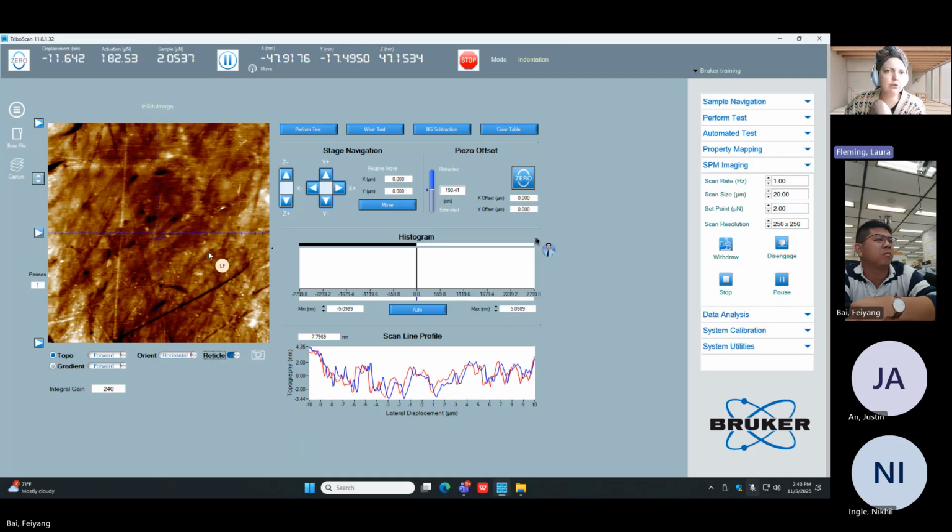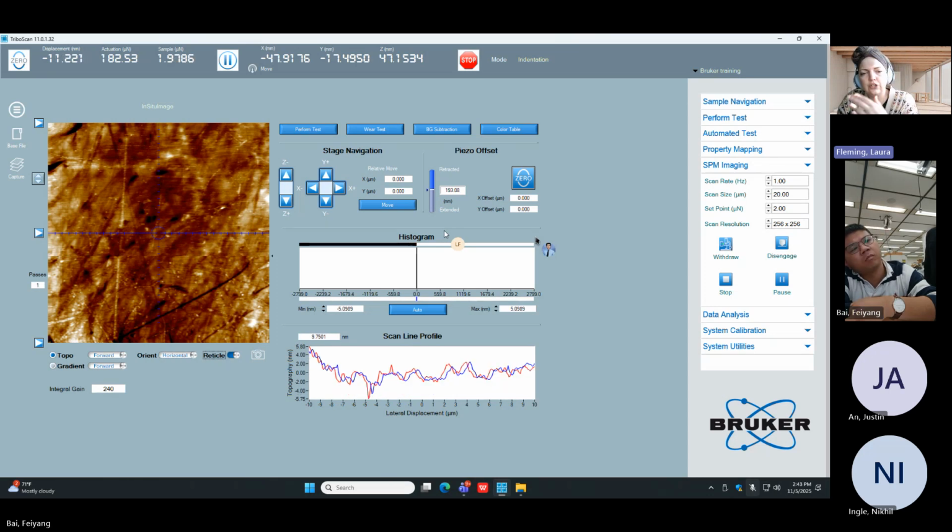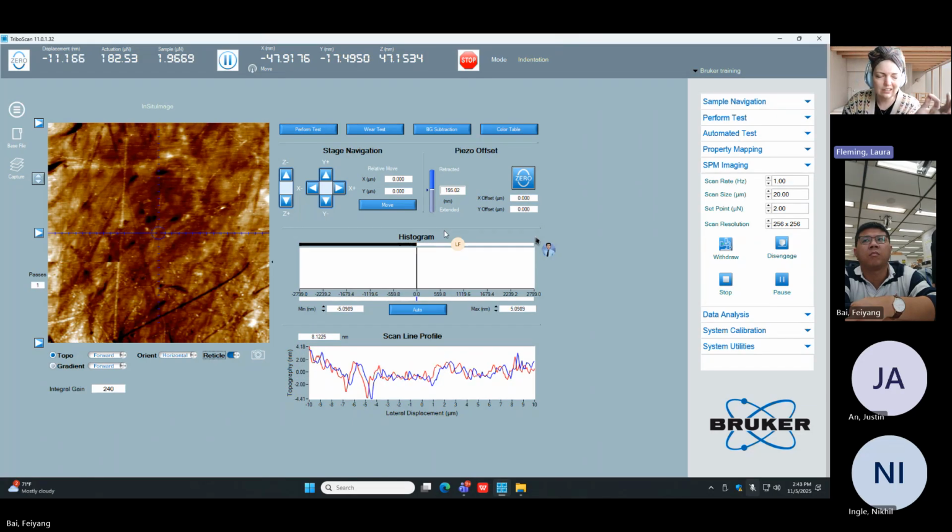You're welcome to use those. I generally don't unless we're trying to get really specific on where we're hitting, meaning within nanometers, even hundreds of nanometers. Generally speaking, the stages are just fine for most uses. The only reason I discourage the piezo offset slightly is that putting a large voltage on a piezo material ages it. So the longer you sit there with an offset applied, the more chances you run of aging that material prematurely. So generally I like the stage movement a little bit better.